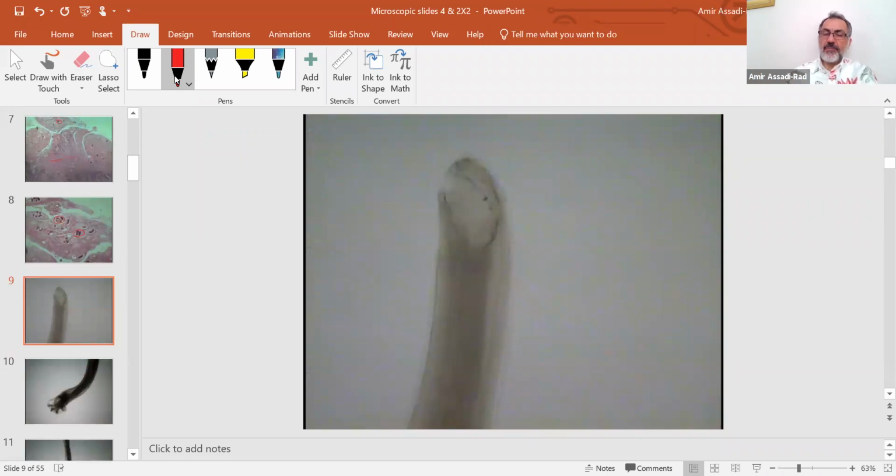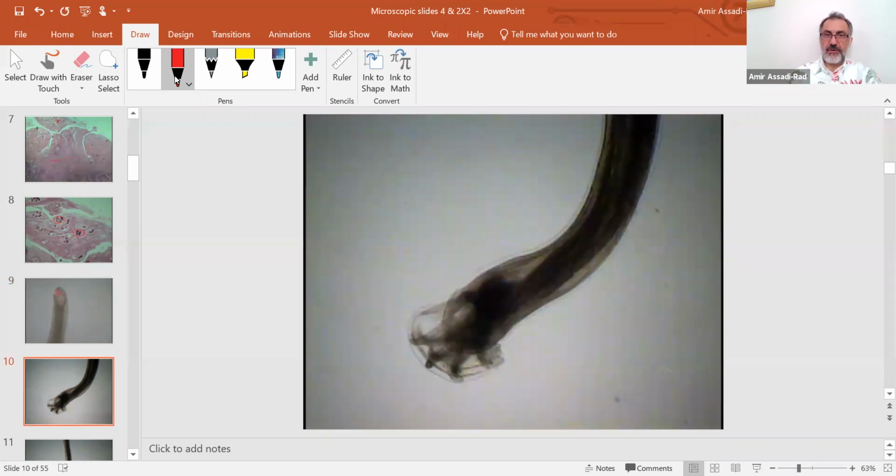This is your hookworm, common name hookworm. If I ask for a scientific name, you can write down 3 names, Ancylostoma caninum, Necator americanus, and Ancylostoma duodenale. This name of the structure is teeth, okay, or cutting plates. Sometimes they have cutting plates. So in here, you don't have to worry about it. Either one, cutting plate or teeth, is correct for our purposes.